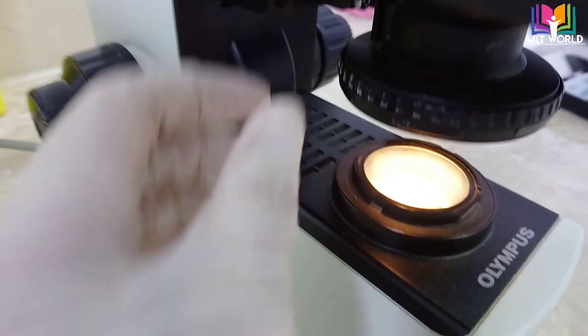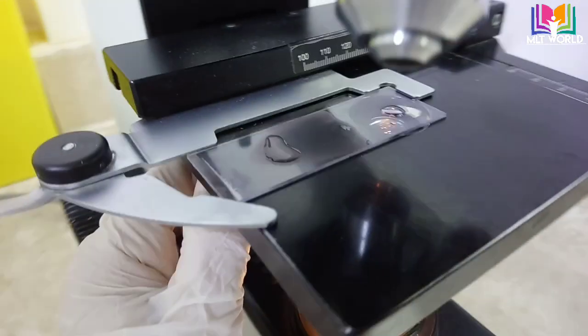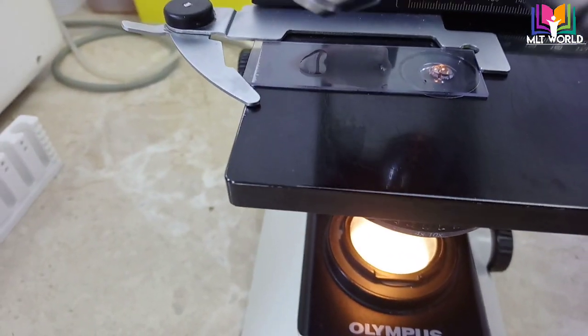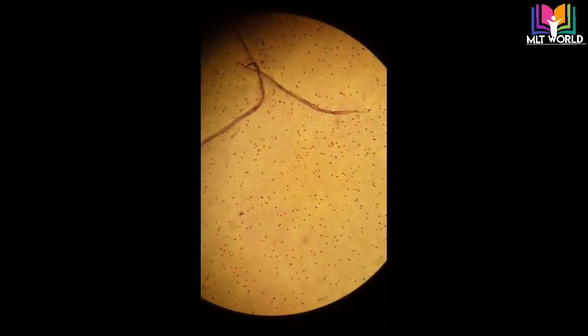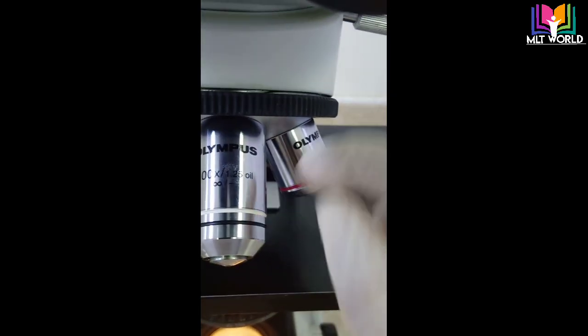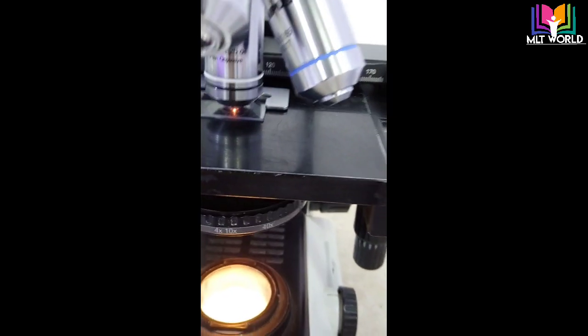Make the condenser fully up. Now with 10x we choose the field — this is the thick smear. Now we will move directly to the 100x oil immersion lens.